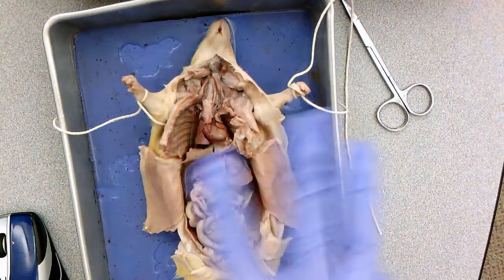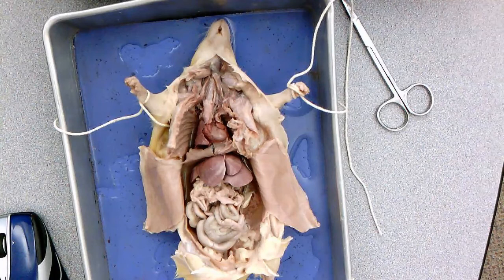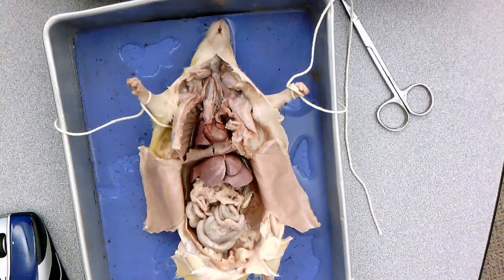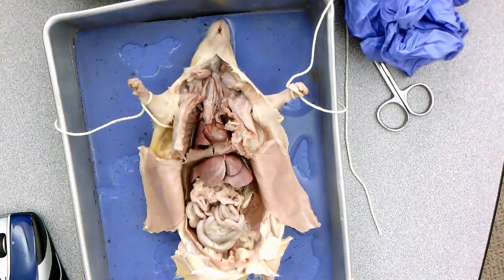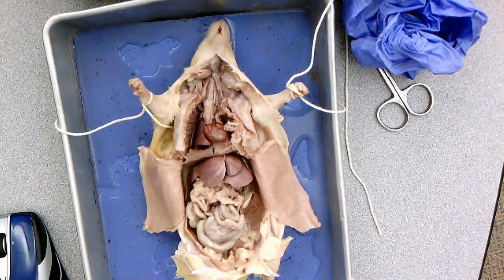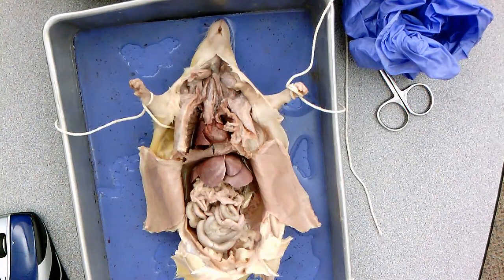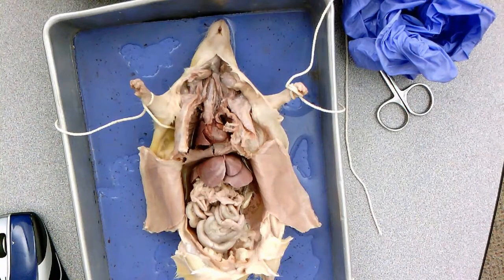This lab has 3 separate grades associated with it. One you're getting for skinning the rat. The second grade is for identifying those organs of the abdominal pelvic cavity. The third is identifying those organs of the thoracic cavity, as well as those organs and structures associated with the neck, mainly the trachea and the esophagus, and that neck region is what you're going to identify on the rat. Make sure you're taking good quality pictures so that I can see what you're identifying is correct.